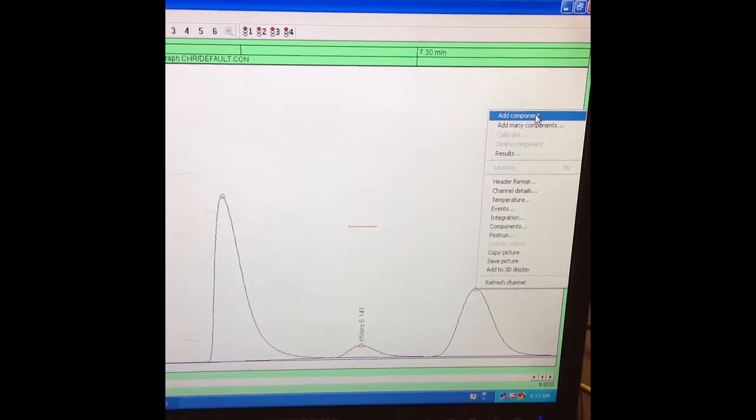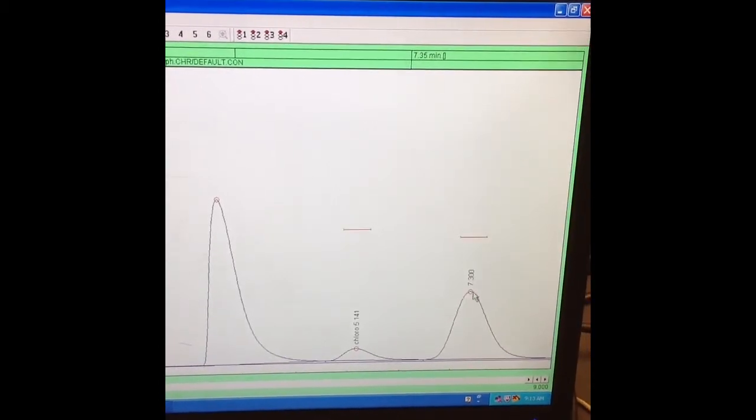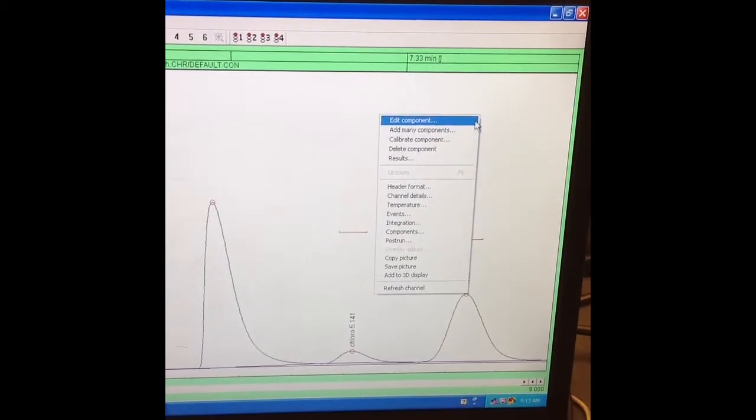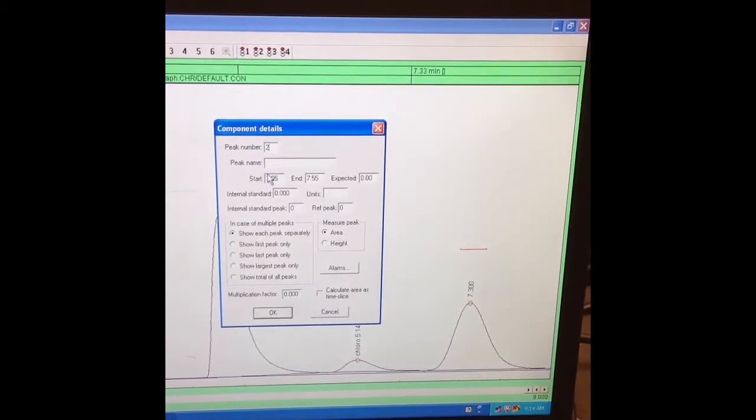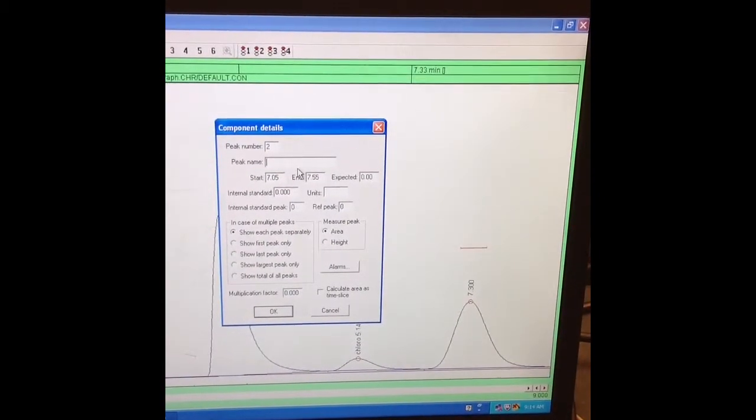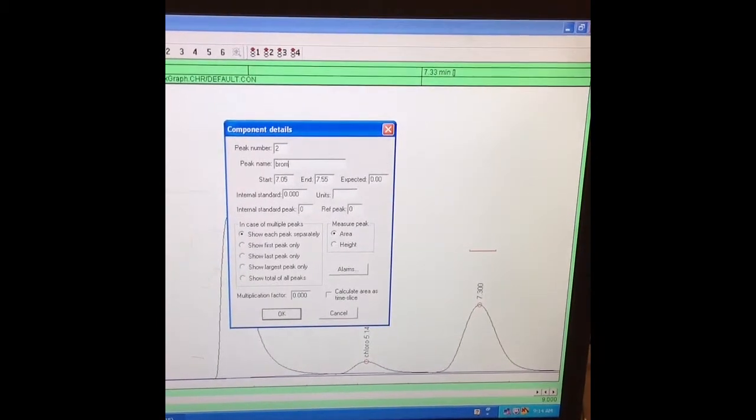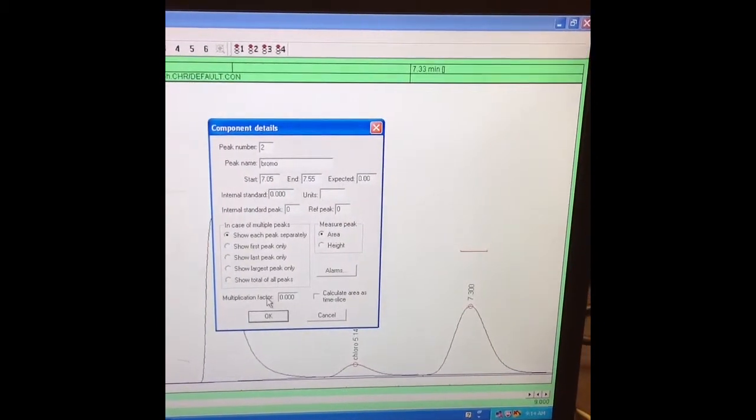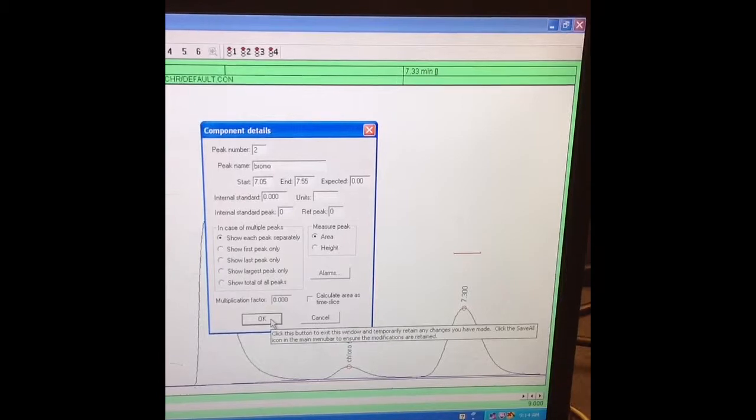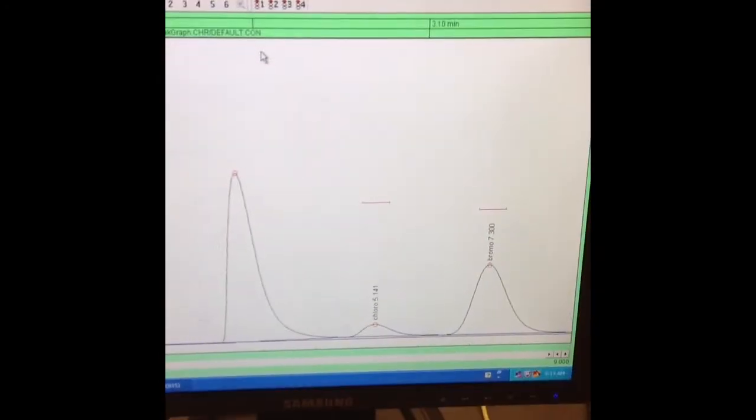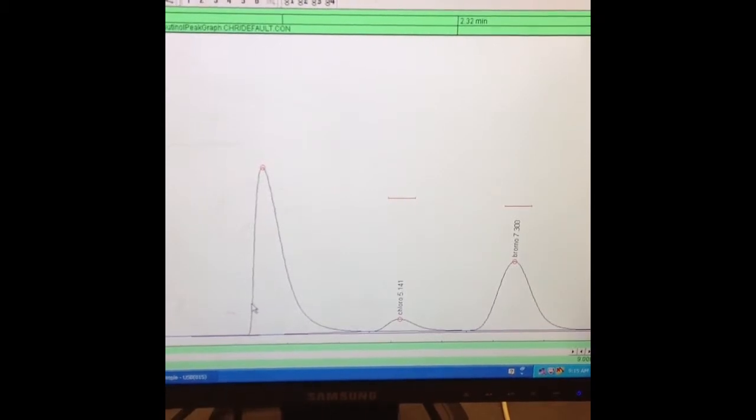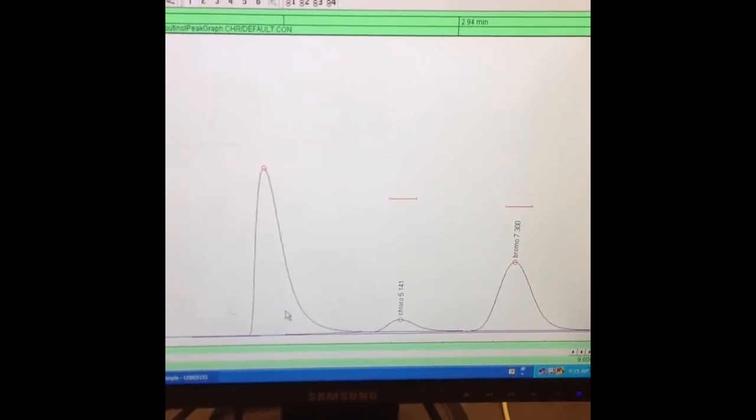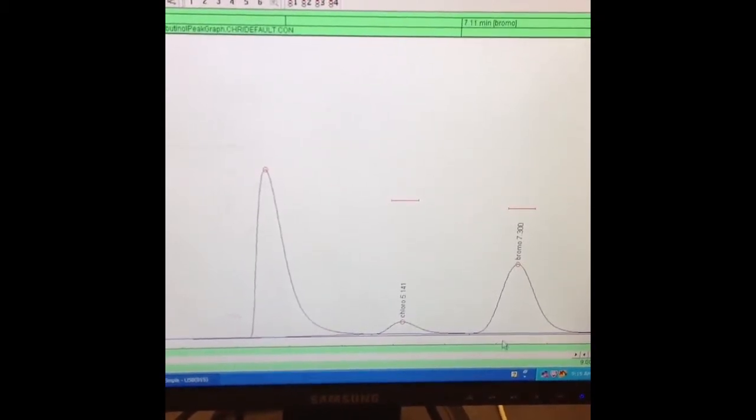And then same methods for this. So I'm going to add a component, go back, and then edit that component. Call this Peak 2, and I'm going to name it bromo. And again, we know that it's based off of standards. So pentane, we really don't care about this peak because it's a solvent, and we really care about our products done here at chloro and bromo.